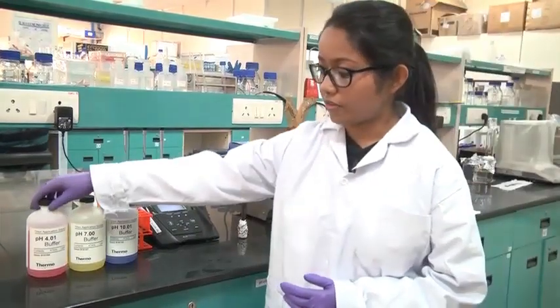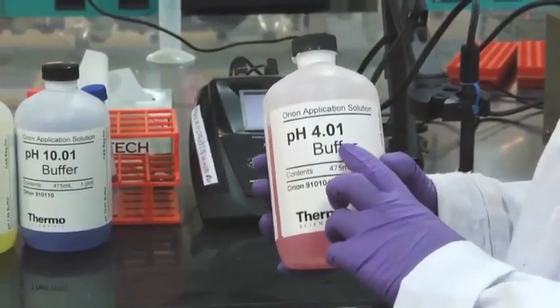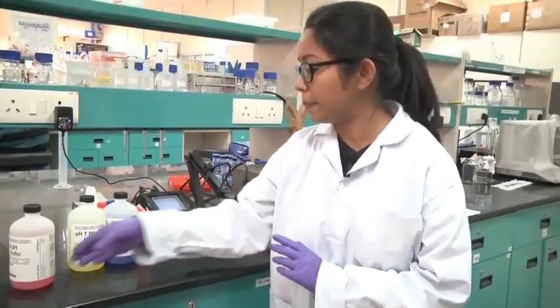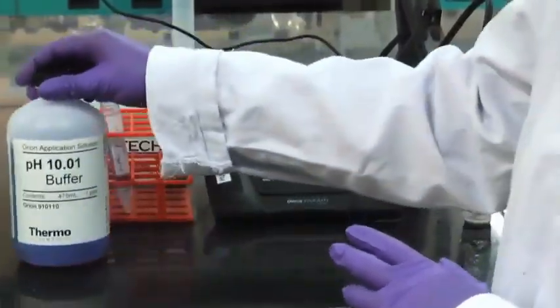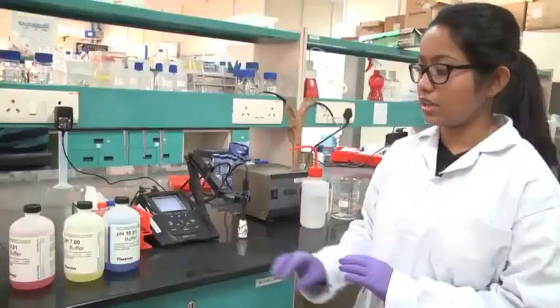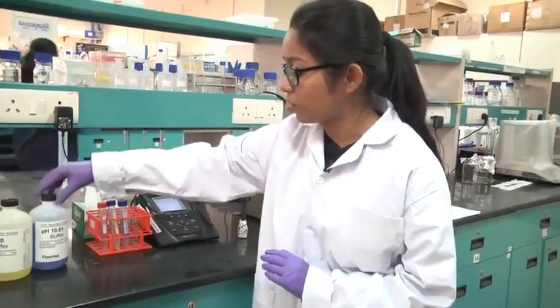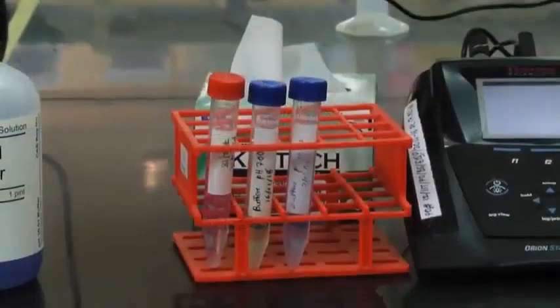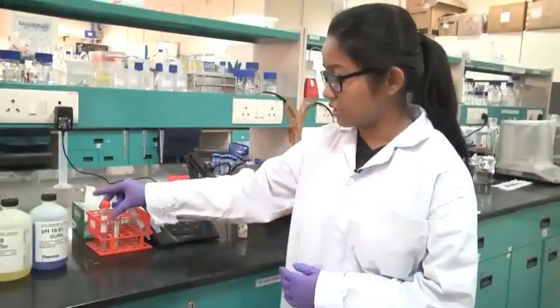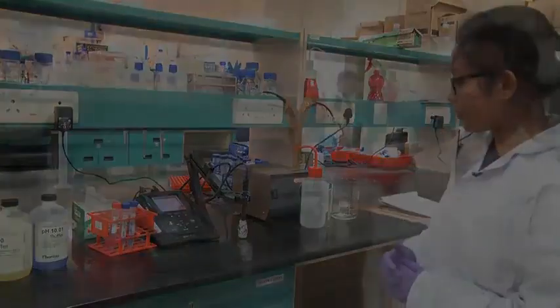Again, the manufacturers have provided us the different solutions. One is of pH 4.01, another one is pH 7, and the other one is pH 10.01. All these solutions are buffered, and from these 3 bottles, I have aliquoted small volumes of these solutions into 3 Falcon tubes. Now I'll show how, using these 3 solutions, we will calibrate our pH meter.